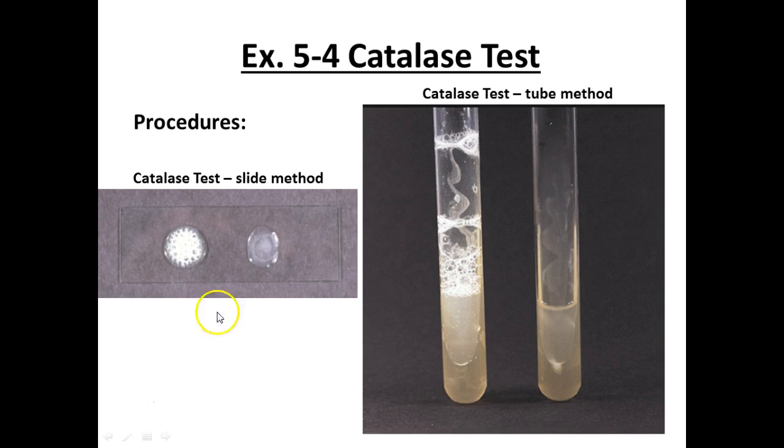So we did this on a microscope slide, right? Most of you guys saw it quite well. And we also did it right on our slant. And that tube is definitely dead and gone. Those organisms are not usable.